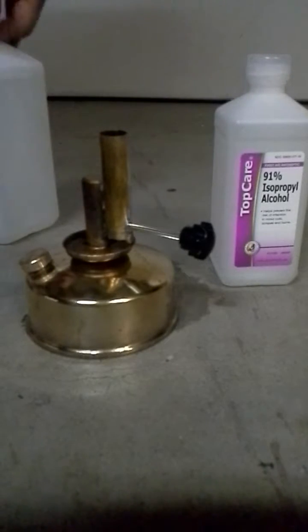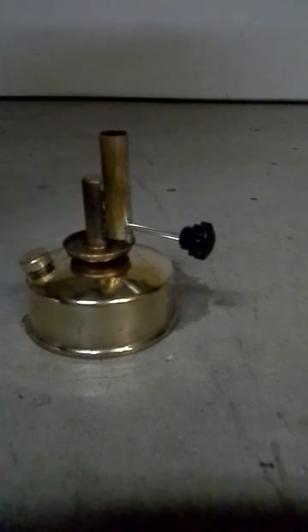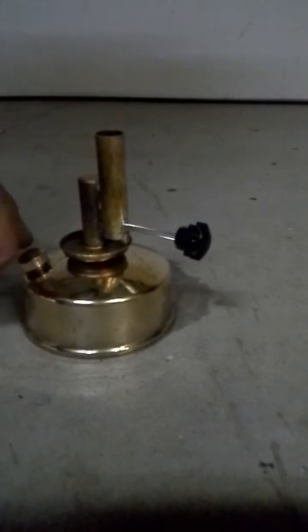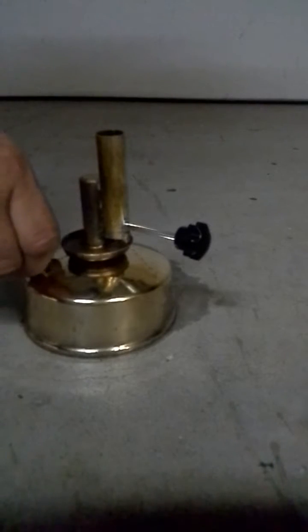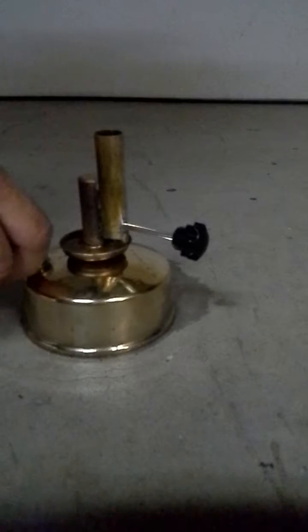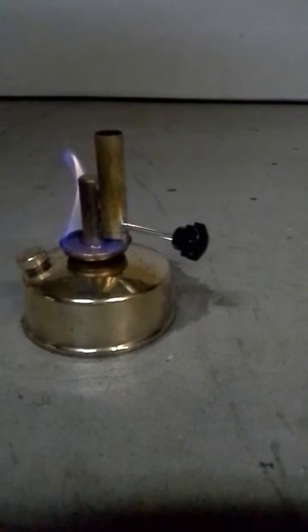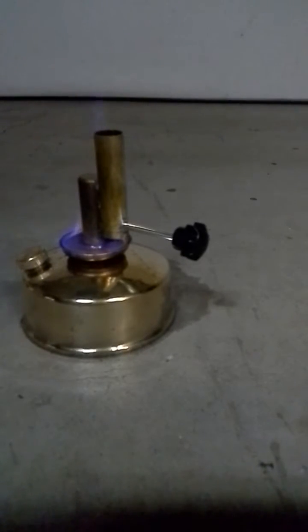Nope, still did. Okay, just make sure it's got good pressure here. So we're gonna let that go just like that, and we wait. When it heats that up you should be able to hear it already going.